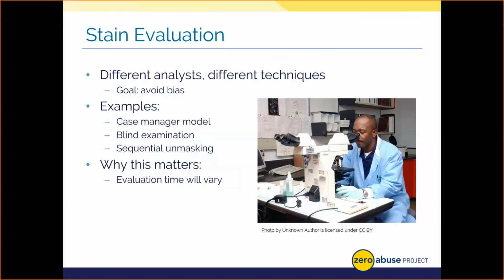Lastly, some professionals use sequential unmasking. This is something that I've used, where they make certain key analytic judgments before being exposed to potentially biasing information from an investigator or other MDT members. In short, they might try to examine evidence and avoid case notes or contextual information until they hit a roadblock. They may only read a quick case synopsis and work from that before they then call an investigator or subject themselves to potentially biasing information. As you can see, there's then a spectrum to unmasking information with sequential analysis.